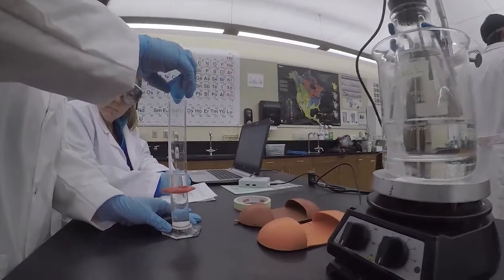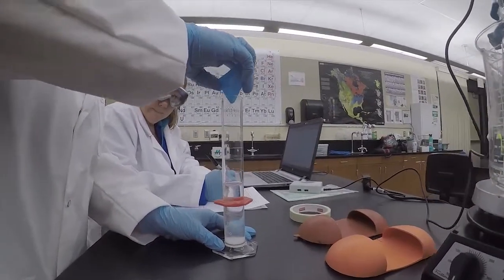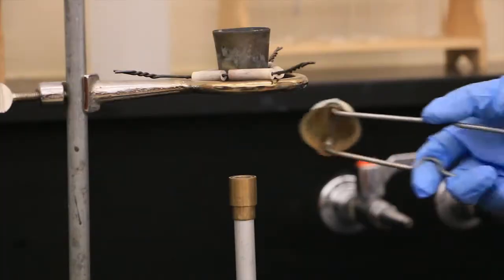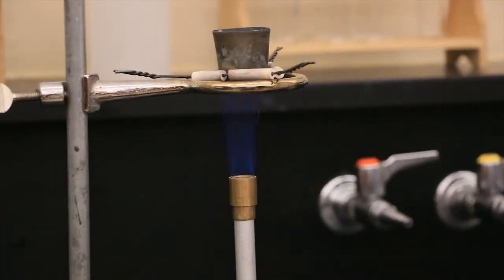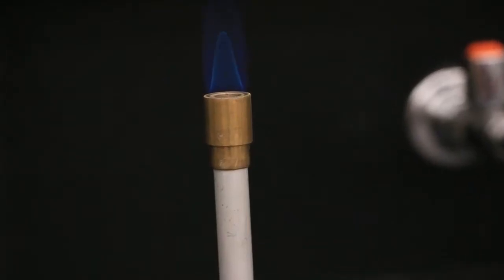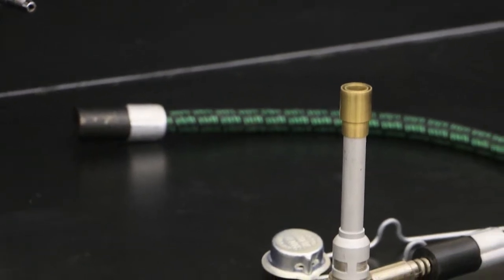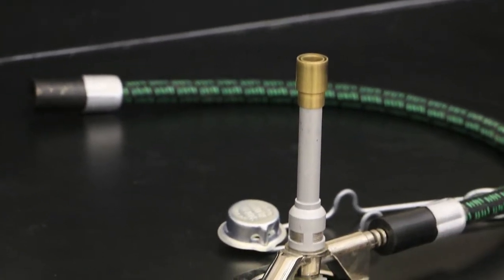Also, cell phones, laptops, and other electronic devices should be used for lab purposes only. Paying attention to your experiment is much more important than your social media. It can wait. With that said, never leave a Bunsen burner or hot plate unattended. Always turn the burner or hot plate off when not in use. When working with a Bunsen burner, check the gas supply line for any cracks and openings.